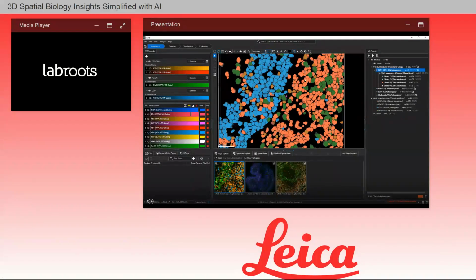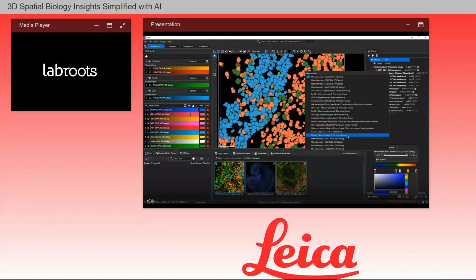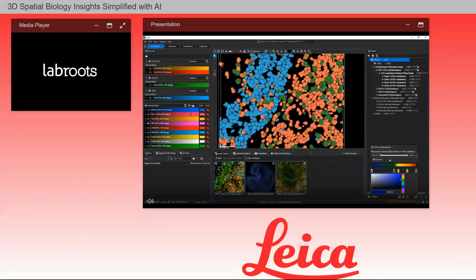Another new feature of Aivia 14 is color by measurements. I am going to select my meshes object set and at the very bottom, change the color setting to color by measurements. Once again, I will use the nearest object distance and change the color scheme to a different rainbow spectrum. Then spotlighting the PAN-CK positive subset, you can see where the PAN-CK cells are and where the CD3, CD4 cells are, and the relative distance between them, with red being the closest and blue being the furthest away.